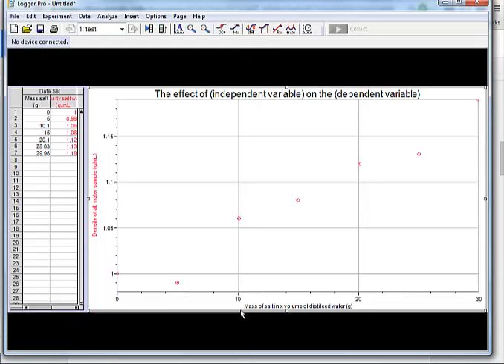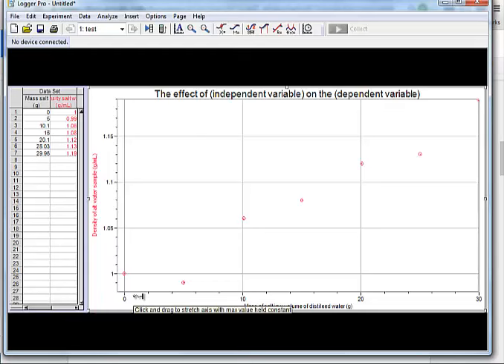See that? Now, there's a problem because this data point right here, right around the number 1, is kind of like stuck on the line. I want to get it off the line. So I'll move the cursor to where I see this emblem just below the horizontal axis. And that allows me to right-click and hold and pull it out a little bit. Now I can see where that data point is. Does that make sense?